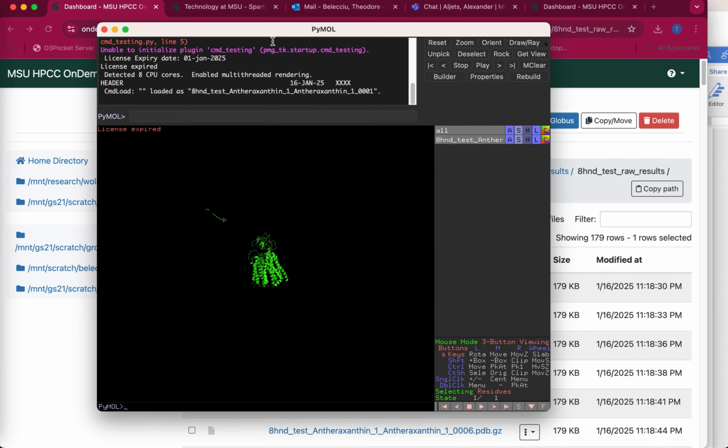Okay, so you can see the ligand and you can see the protein. In this case, the ligand is way outside the protein, but that's because the coordinate that I put in was a really bad coordinate. I used the coordinate not for this file, but for the example file from the guide. I should have used the coordinate for this file instead to actually place it in the center. So one thing to keep in mind is you really do have to check the starting coordinate for your protein file manually, because the same protein file might have completely different coordinates. But this is what it will look like, except instead of being here, ideally it will be there.